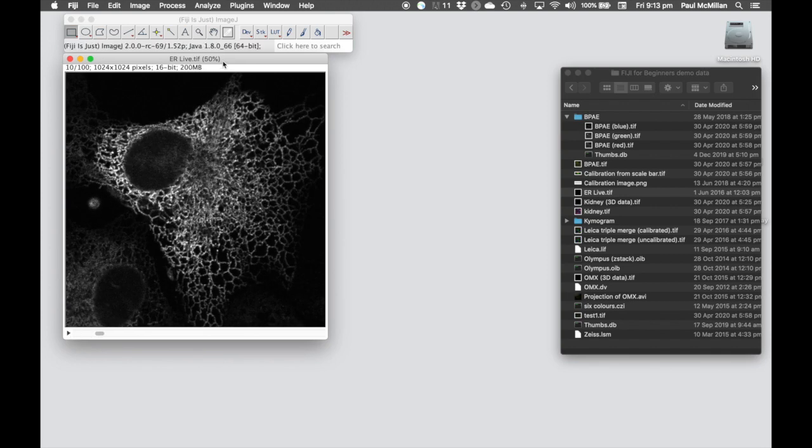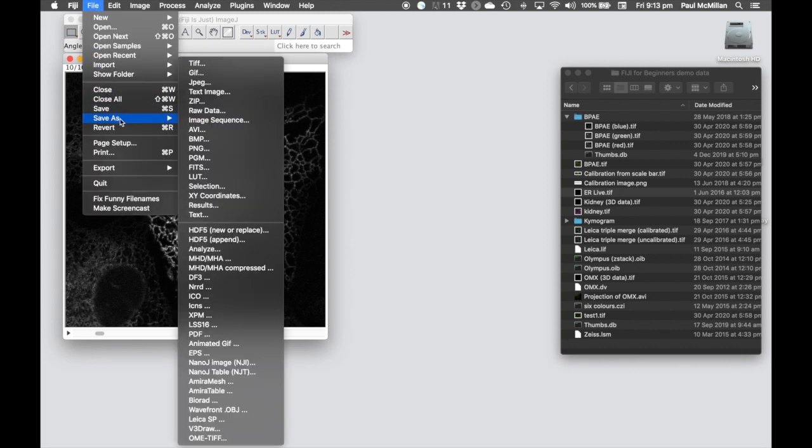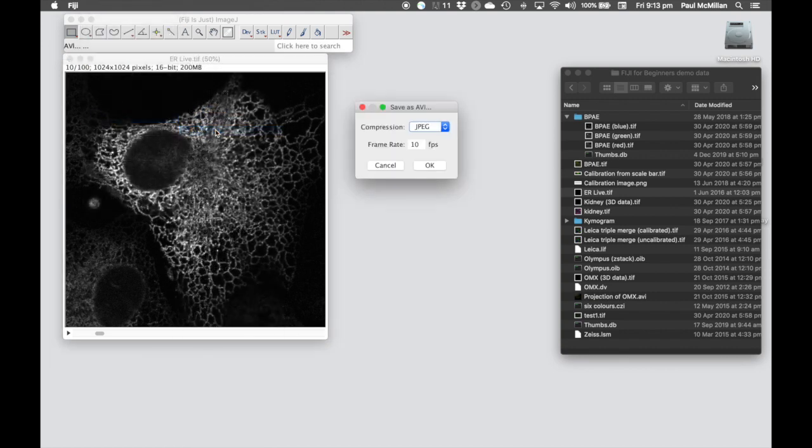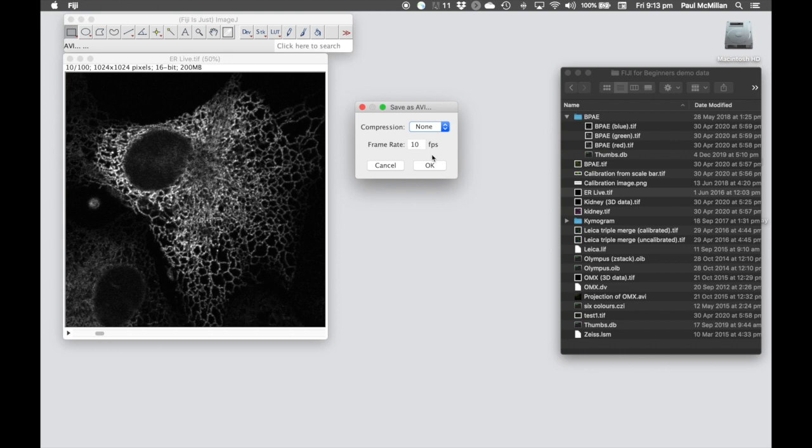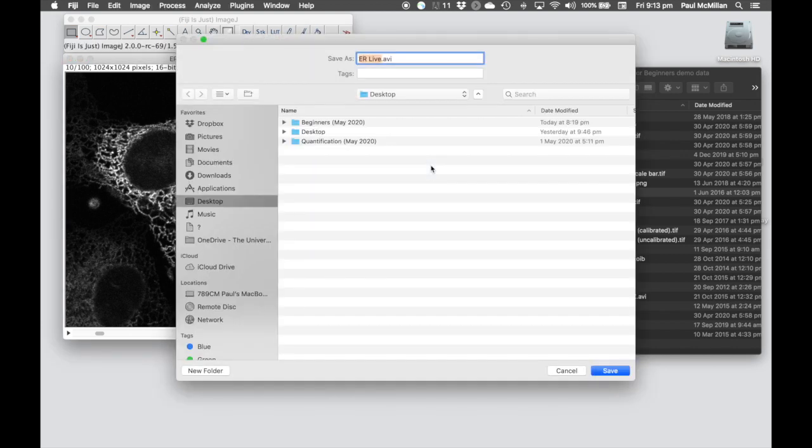The other thing we can do is go in and change the lookup table as well, convert it to an RGB, and then again, file save as AVI with no compression, and save that file to where you want to.